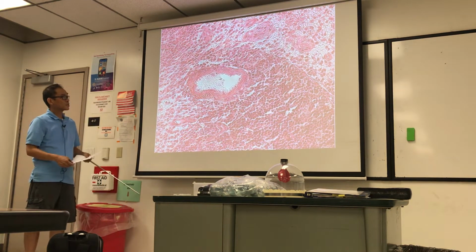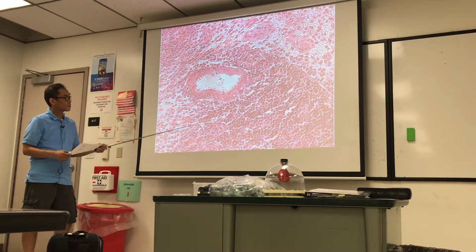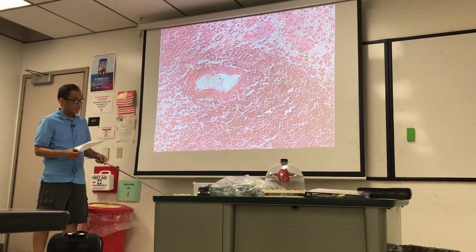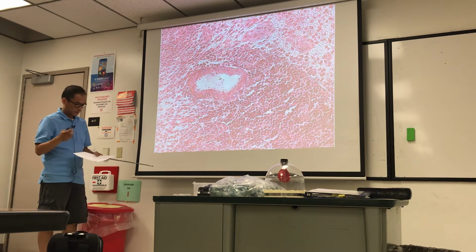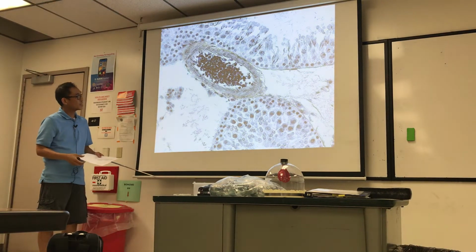This is a much smaller arteriole. It's from the spleen, two layers. You've got a TI, a TM, there's no TA. Technically, the definition is just a couple of layers of smooth muscle, no more. That's about what we see here. So that's arterial. Here's the rat testes slide.